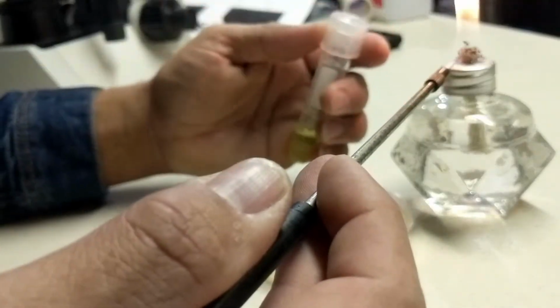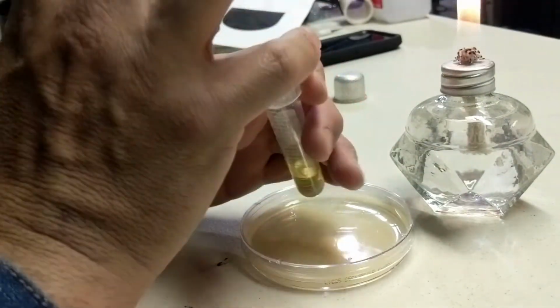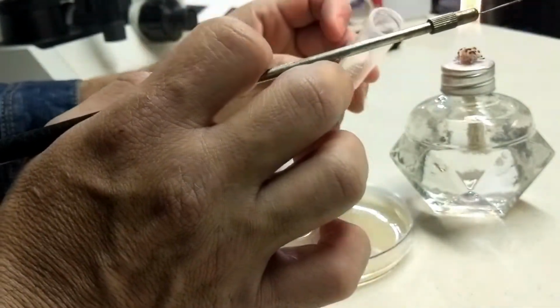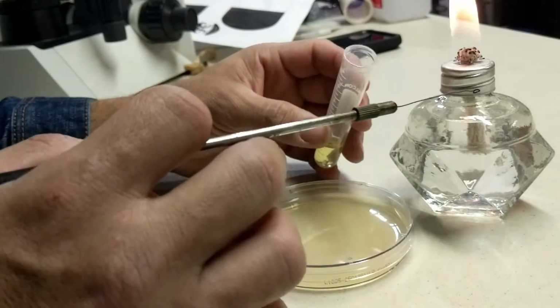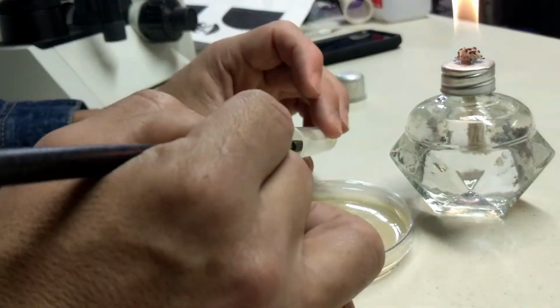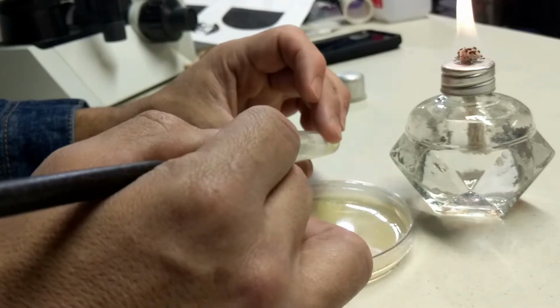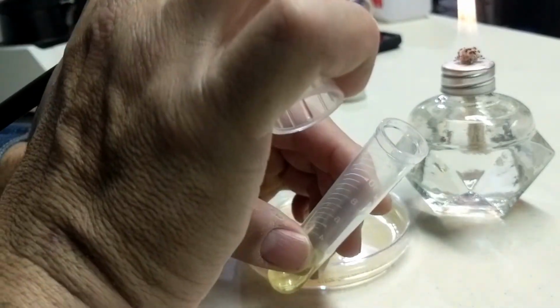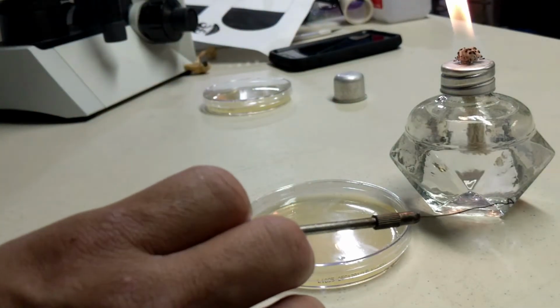Okay, so pretty much what you do is you have to, with this finger, remove the cap, hold it in there, flame the tube. Now these tubes are plastic, so I shouldn't be flaming this, but again, because it's for the example, flame it. After that, you take your bacteria. If you hear something like that, then you're burning your broth. All right, so you take it, now it's in there, put your cap, which you have in your finger. After you seal it, you put it on a rack, always in a rack.